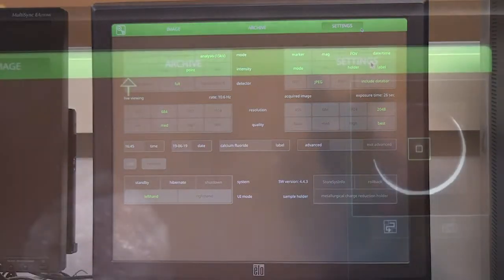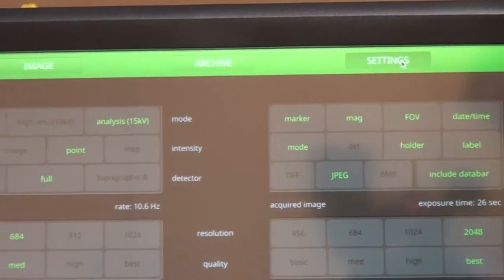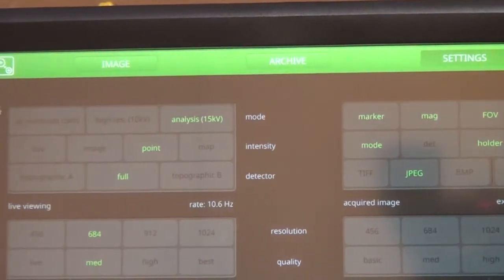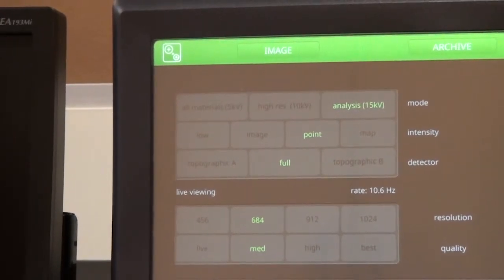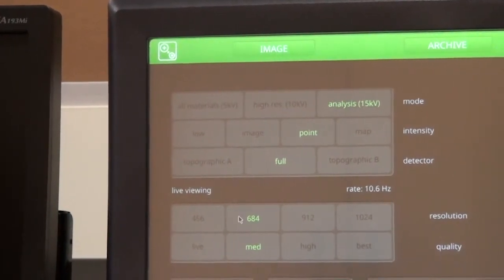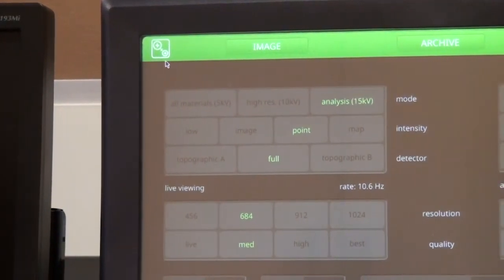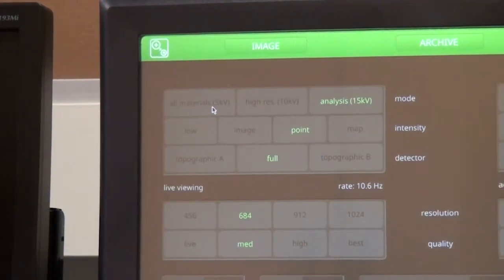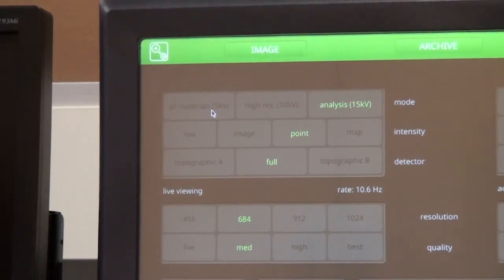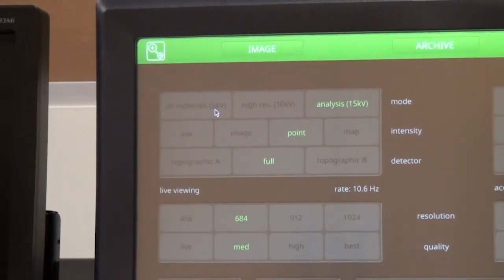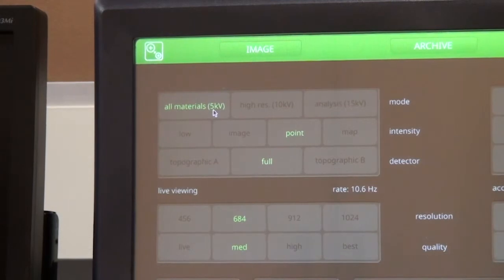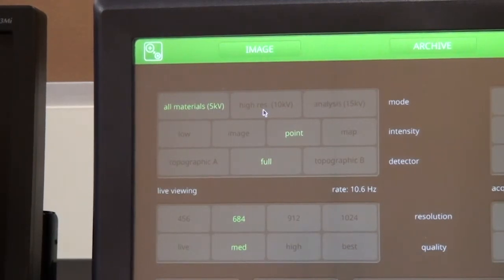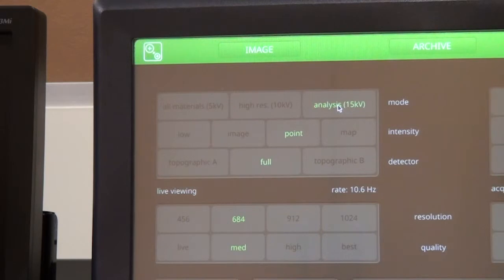This is the settings screen, and we are going to look at the important options for SEM imaging and EDS analysis. The voltage determines the energy of the electrons in the beam, and it can be set to 5 kV, 10 kV, or 15 kV.